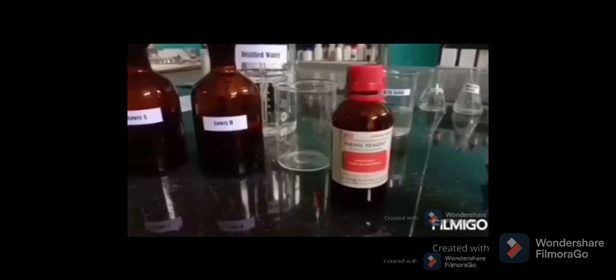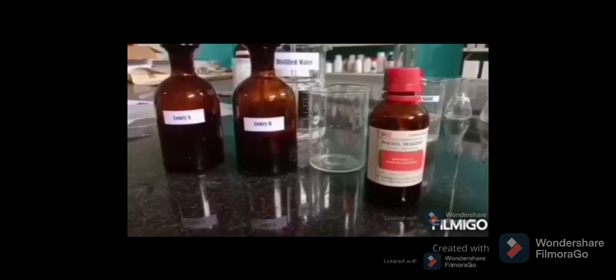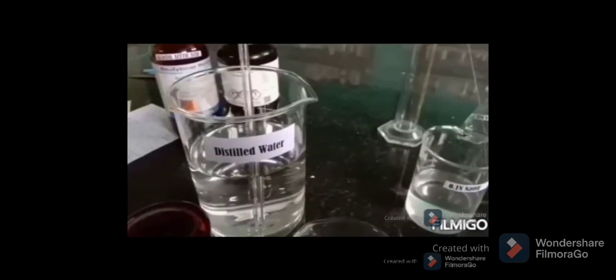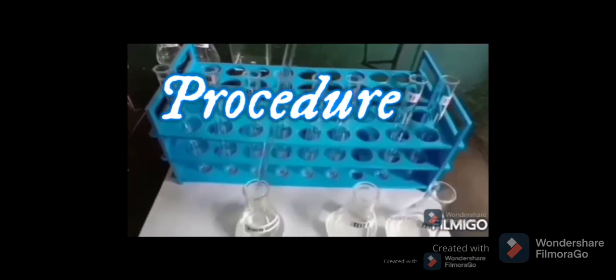Alkaline reagent or reagent C: Lowry A and Lowry B mixed in 50 is to 1 ratio, prepared fresh. Folin-Ciocalteu reagent is also needed. Further, we need distilled water, 0.1 normal NaOH, test tubes marked B for blank, standard tubes S1 to S5, T1 and T2 for test, pipettes, colorimeter, etc.